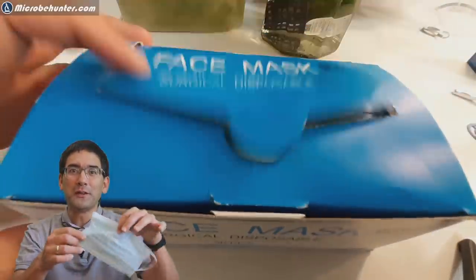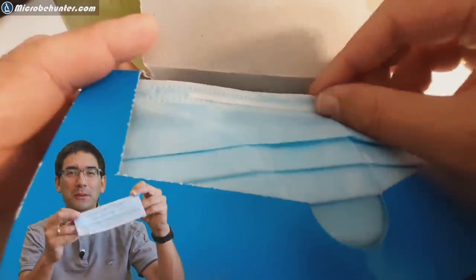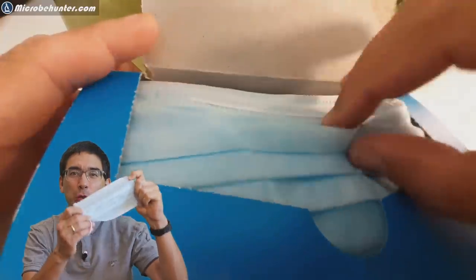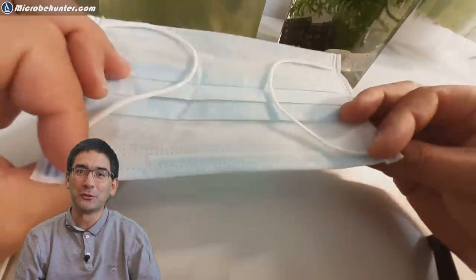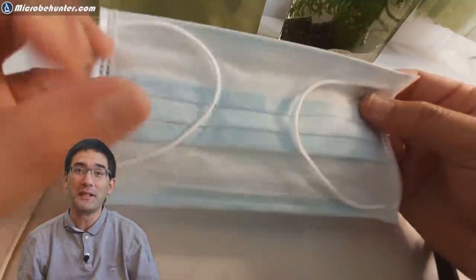Today I want to talk about another viewer request. Can you please put a face mask, a cotton face mask under the microscope? Well of course I can, but I have to tell you right away I discovered something quite interesting here, something that caused me a little bit to worry.